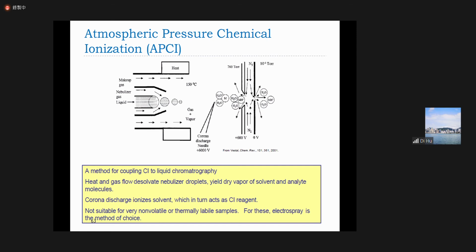Okay. And also because the reagent ions are normally just protonated water clusters, like shown here, we also try to keep the additives and buffers as low as possible. We also want to mention that both APCI and ESI are soft methods. So the mass spectra generated by either technique are typically dominated by protonated molecules if it's positive mode, or deprotonated molecules if it's negative mode.